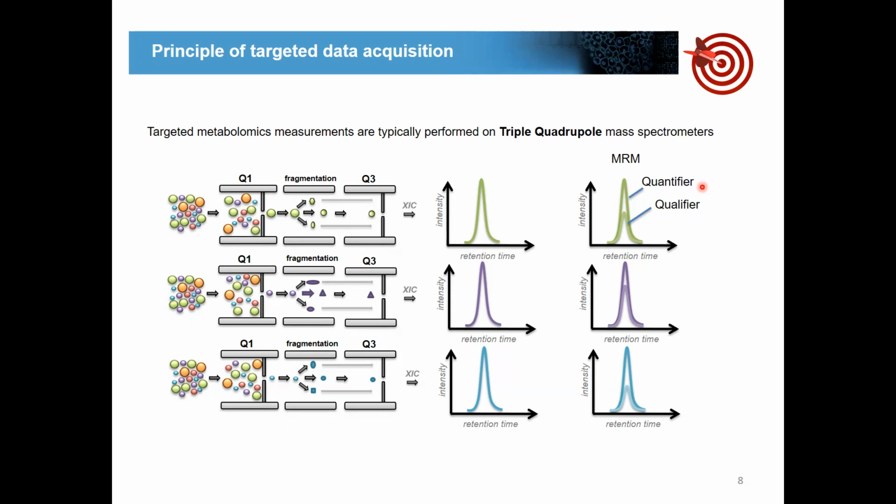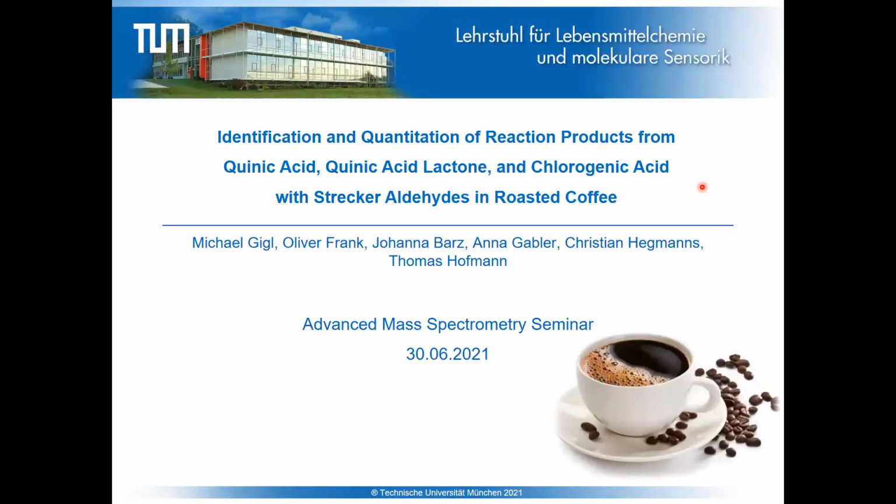Okay, this is already the end of the first educational teaser. I want to then directly switch over to my talk and show you an application of both untargeted as well as targeted metabolomics data acquisition modes.